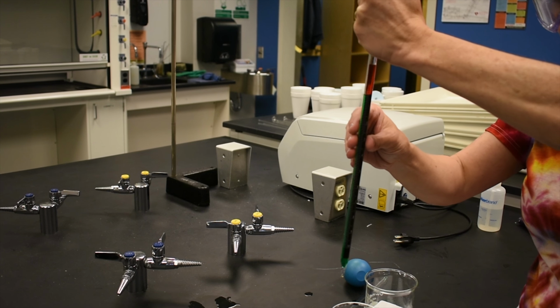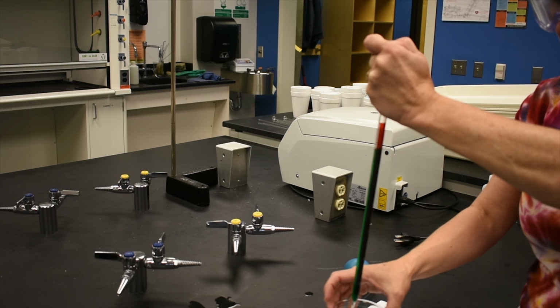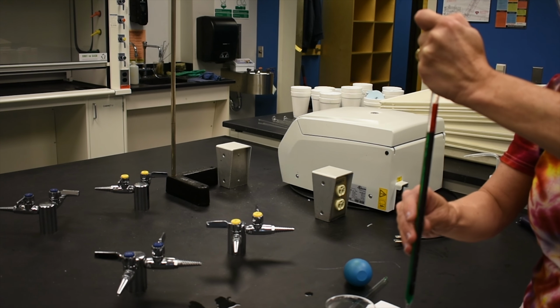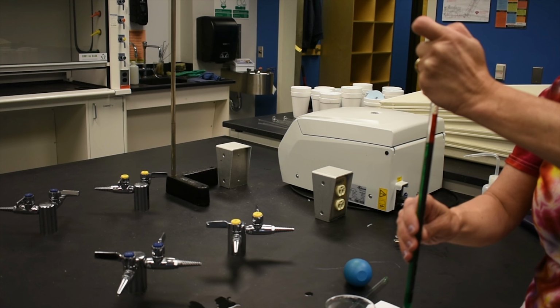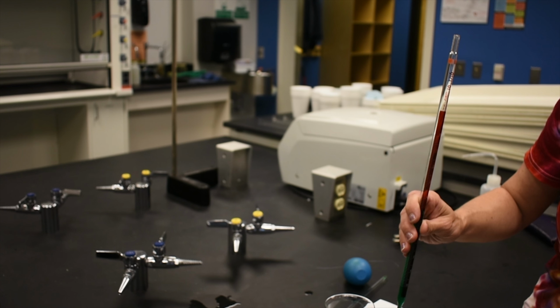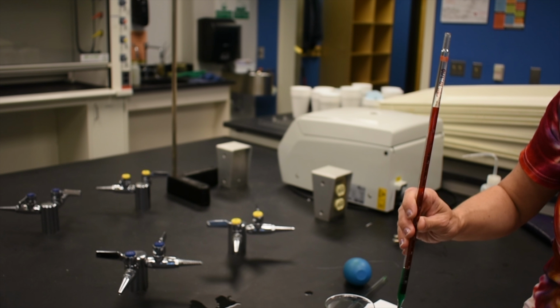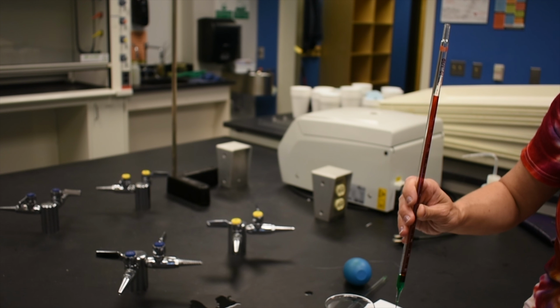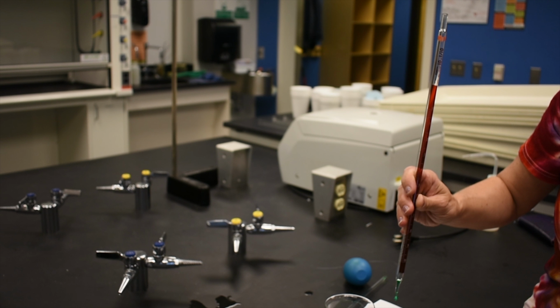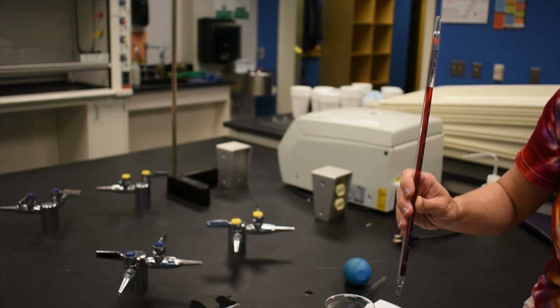Now, for this particular demonstration, I don't really care how much I have in my pipette, so what I'm going to do is remove my thumb from the top and let the solution dispense out into the container that I've chosen to receive it. We'll wait till that's at the bottom. Once that's done, you'll notice that there's a little bit of solution left in the tip of the pipette.